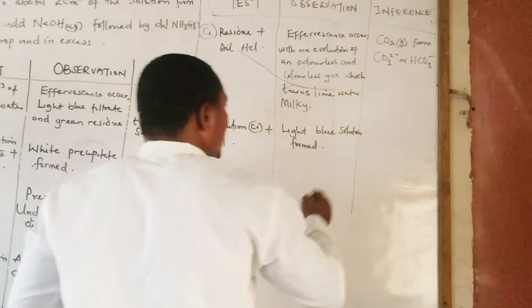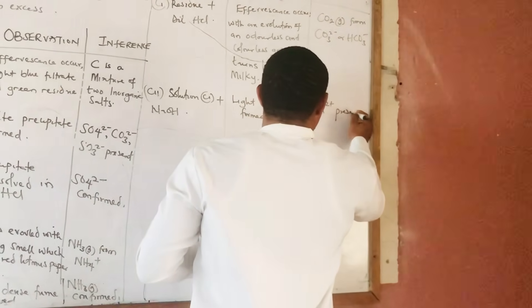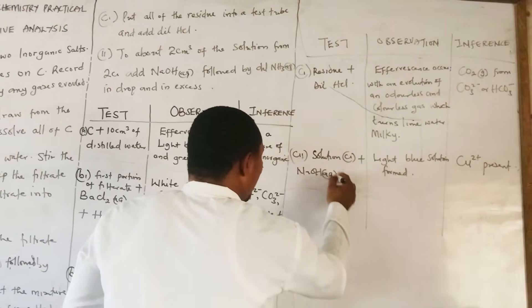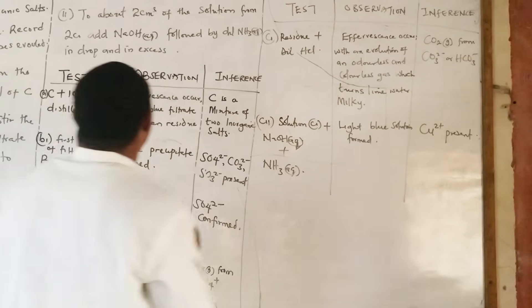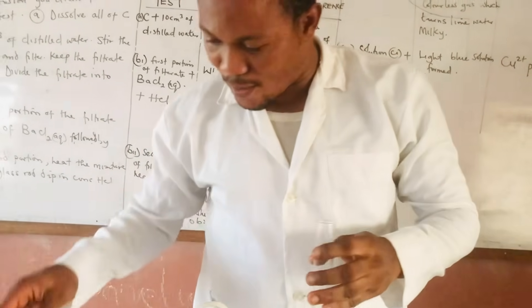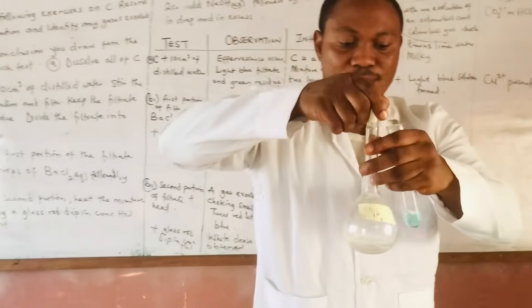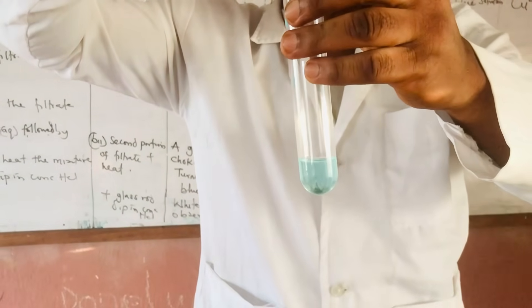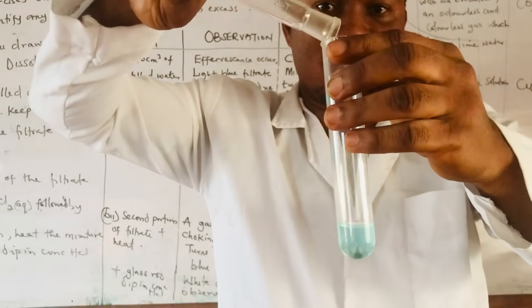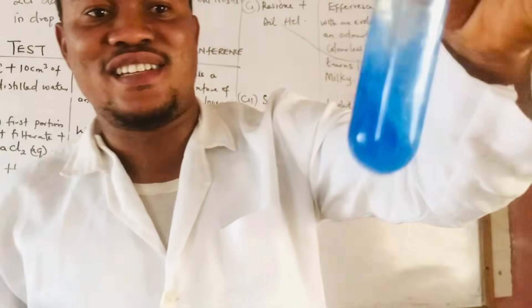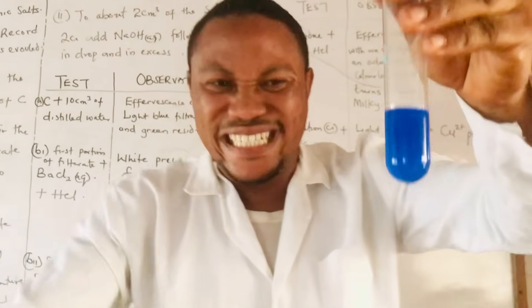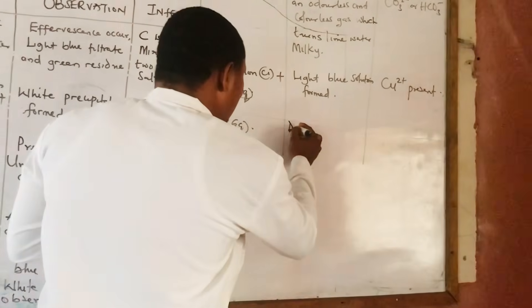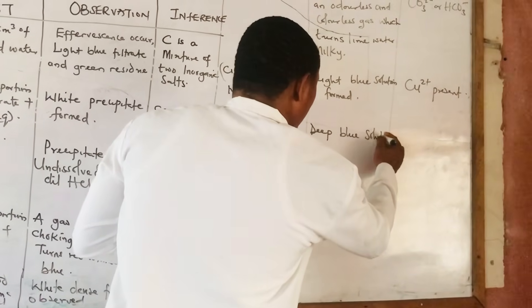A light blue solution — and when you have a light blue solution here, that indicates copper(II) ion, Cu²⁺. Now, followed by ammonia solution in drops and in excess — here's our ammonia solution. Adding in drops: from the light blue, in drops and in excess — we have a deep blue solution formed.